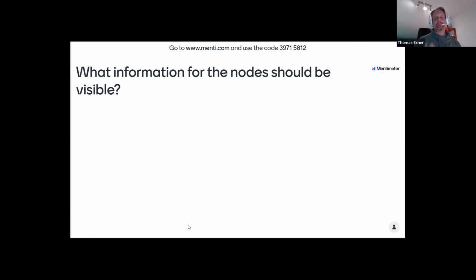You saw that we have these basic informations, and at the moment they are really just the name and a short description, which you see directly in the instance map tool. You see licenses, which are probably not the first thing you would think of, but if you have ideas what the tool itself should present clearly at the beginning, so that you get some idea of what this protocol is, that would be good.